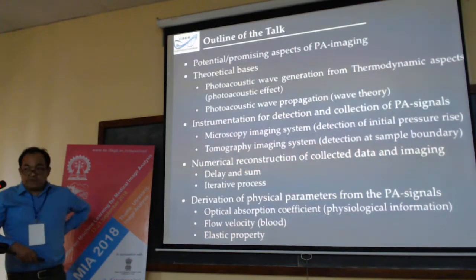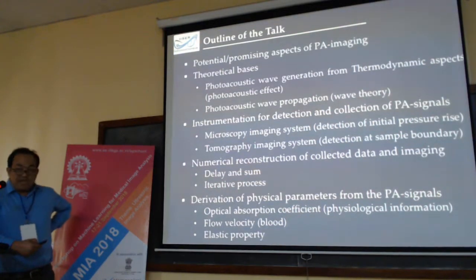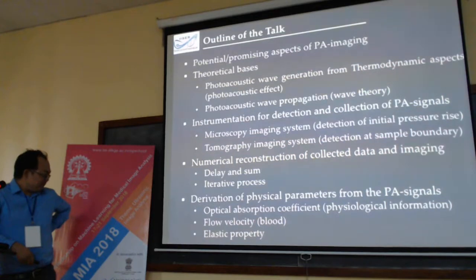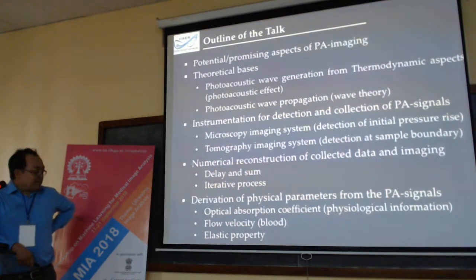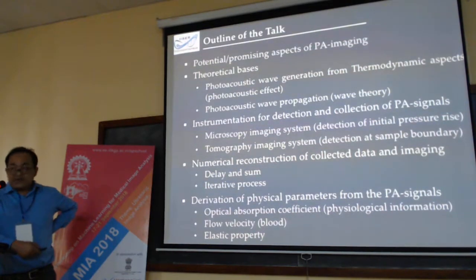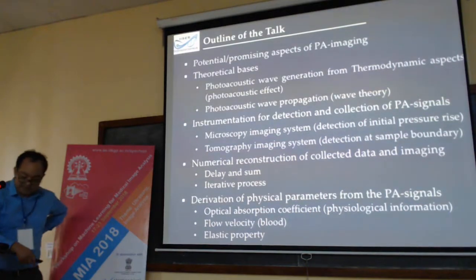and collection of the signal, both for microscopy and tomography, and the reconstruction regimes for the microscopy as well as the tomography. And then, from the detected signal, what are the physical parameters that one can derive, or what is the design to extract that kind of physical information from the detected signal.